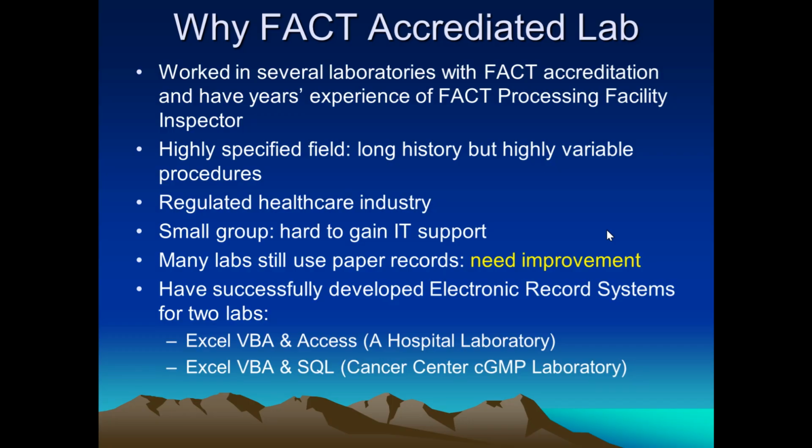With 20 years of experience, I know many labs are still using paper records. This really bothered me, and I have successfully developed two electronic record systems for two labs.